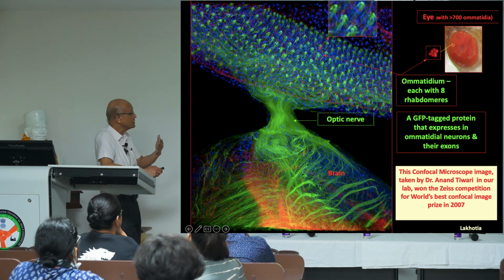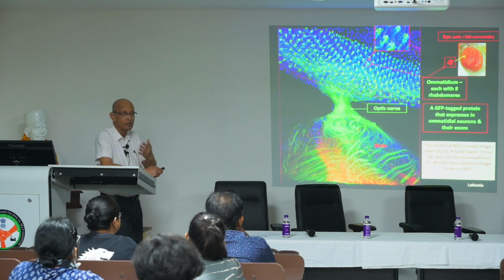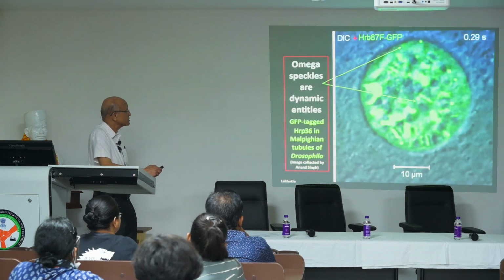And now, of course, the microscopy system, the imaging system has gone much better. And so the system here is supposed to give you much better super resolution besides standard confocal. And that's the advantage of these systems.